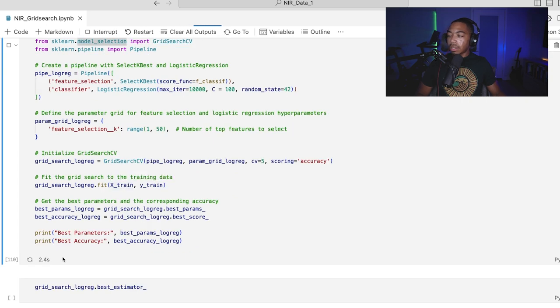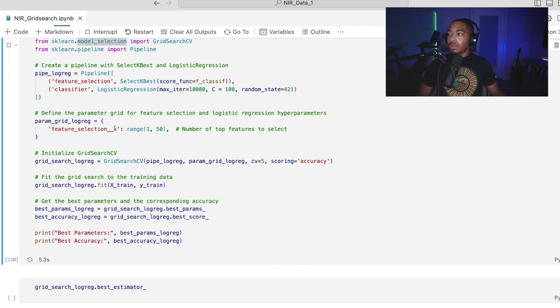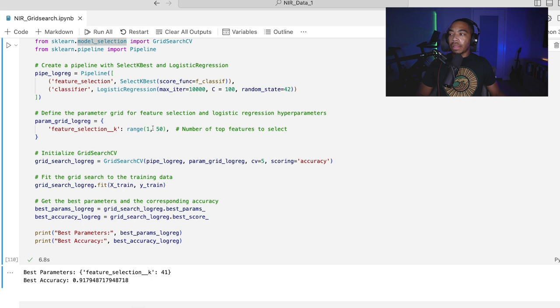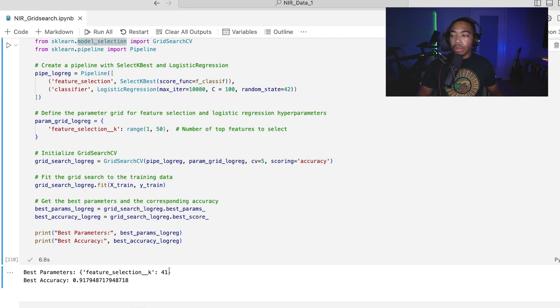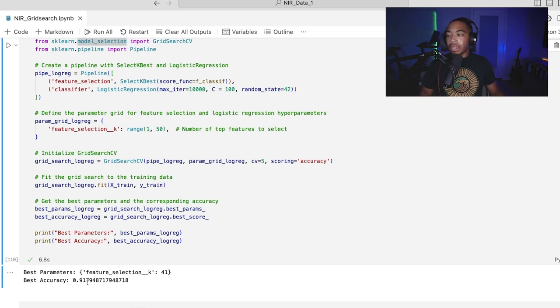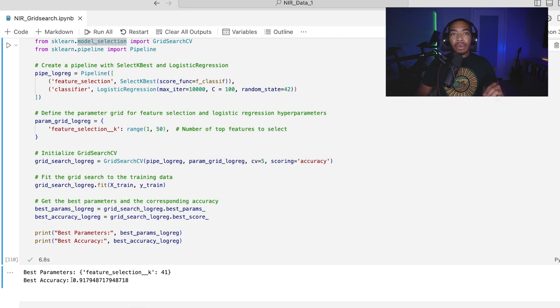So let me run this cell. And it's going to take a few seconds as it moves through each of these values. And after about seven seconds, we can see that it has chosen 41 variables to be the most optimal for this data set.